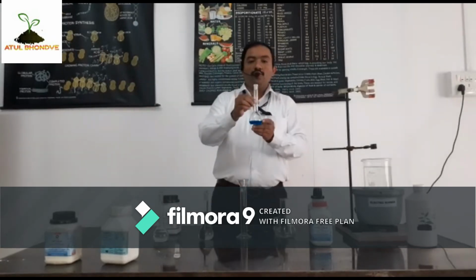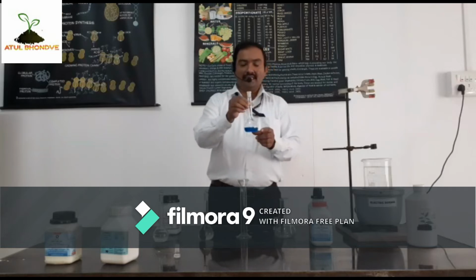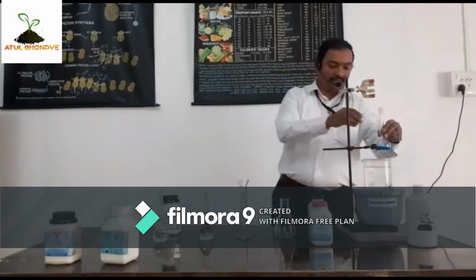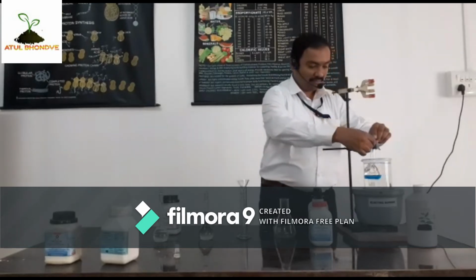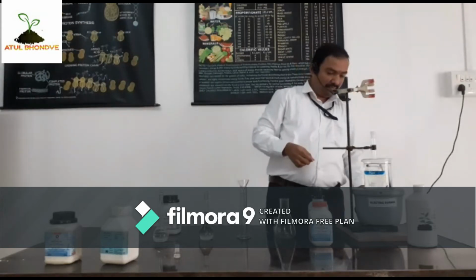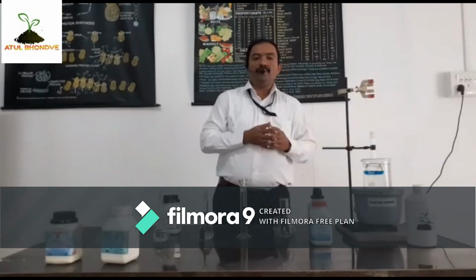So in this volumetric flask we added the anhydrous sodium carbonate powder into the Benedict's solution, and now heat the content on a water bath. The heating of Benedict's solution started here.